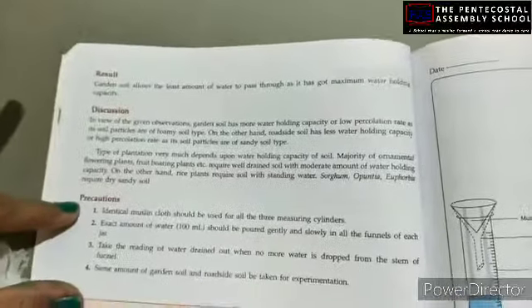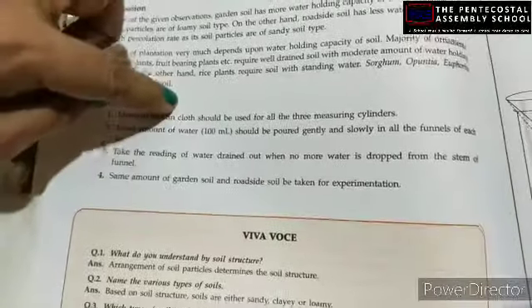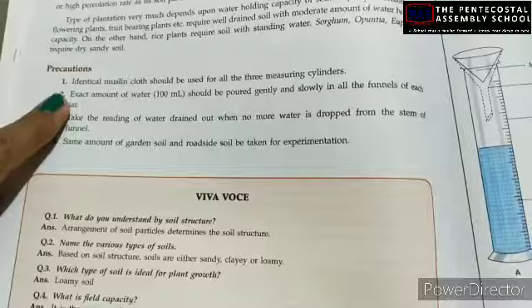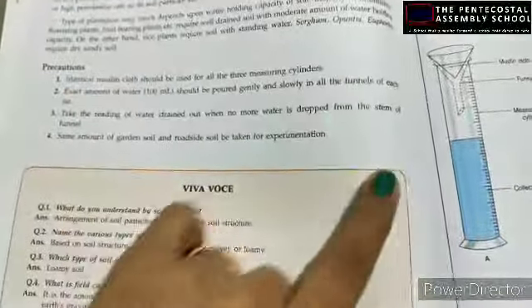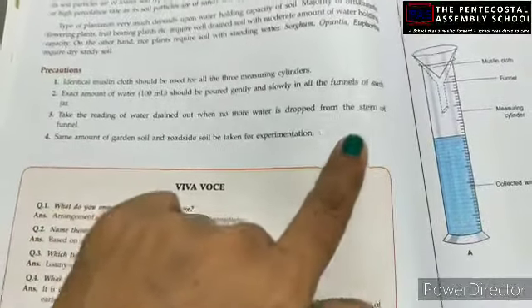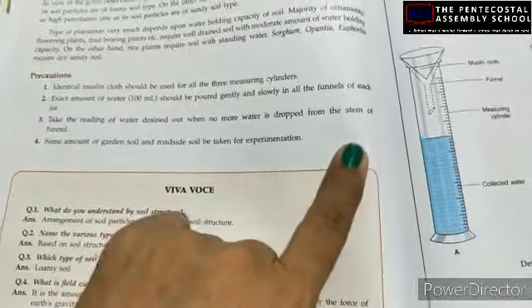What precautions do you need to take? You need to take identical muslin cloth or filter paper. You need to take an equal amount of water for each sample, and take the reading of the water drained out when no more water is dropping from the stem of the funnel. So you have to take care of that.